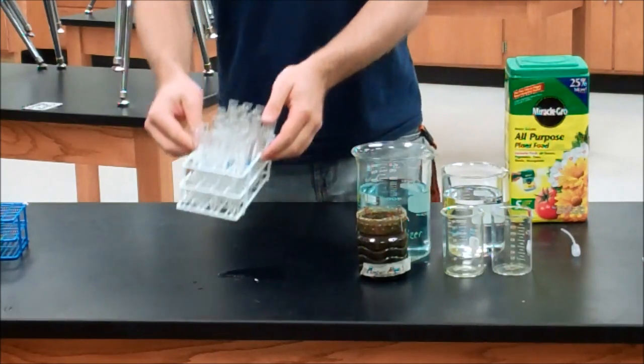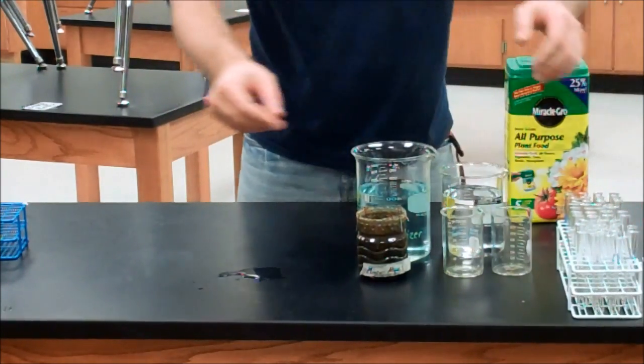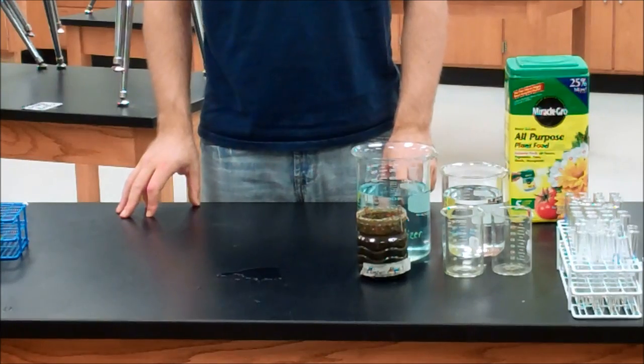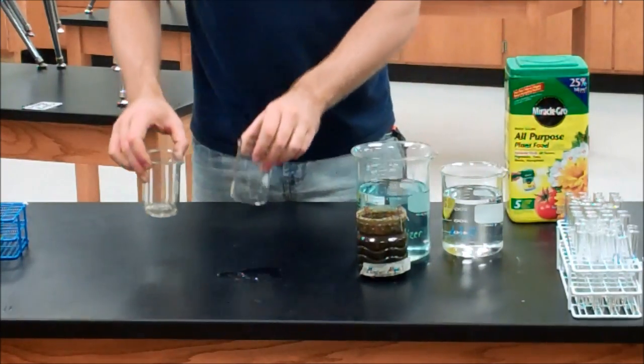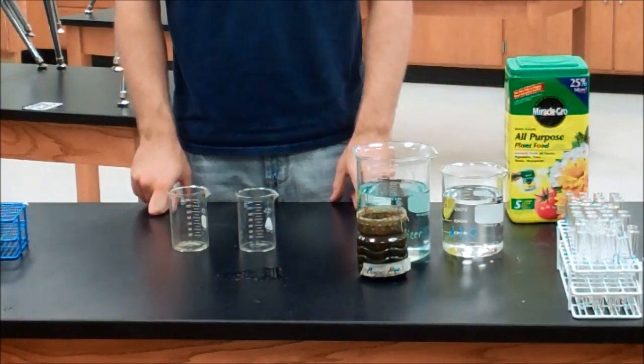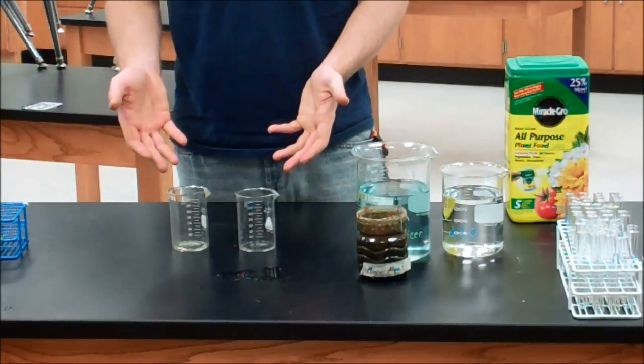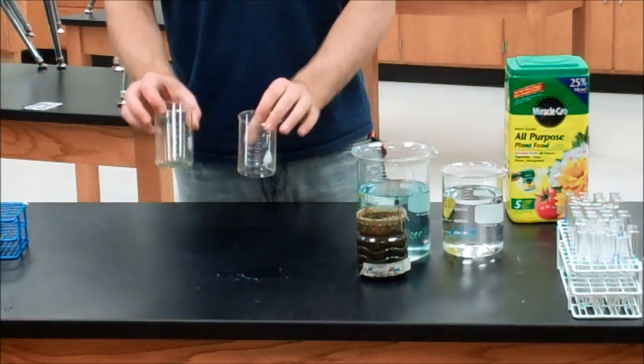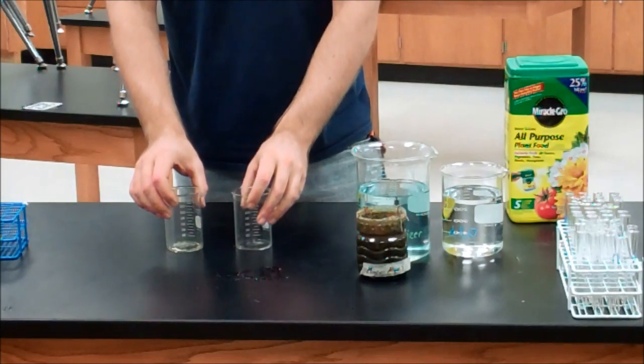From here it's time to start making dilutions of our fertilizer. To do our dilutions you're going to need two equal volume containers. They could be anything from disposable cups, Dixie cups or beakers. As long as they're the same size they're going to work fine.